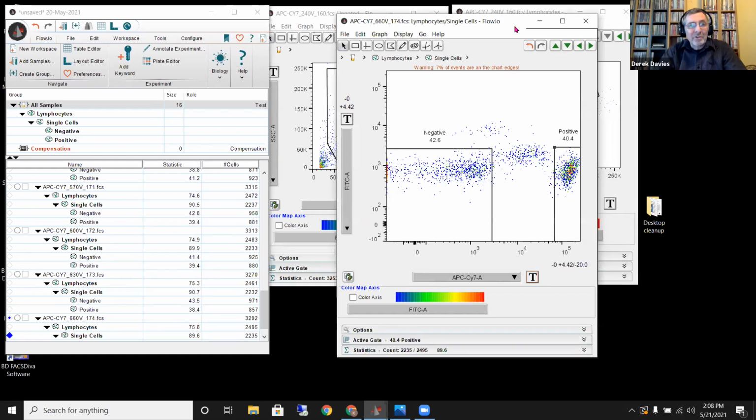So I suppose one question that we might have had before as well is that it's a bit of a chicken and egg situation, isn't it? Yes. Because you need to have this titrated really before you do the voltration. Exactly.